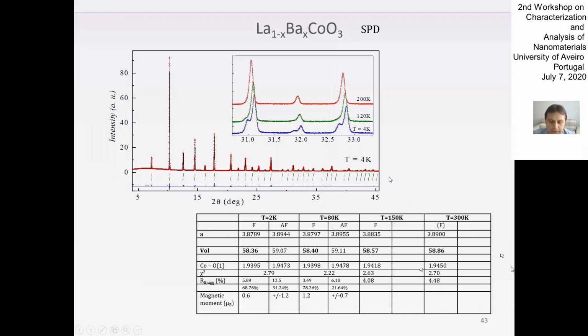So about this phase separation, we discovered it using synchrotron radiation. Then we refined two structural phases. It's not because of the drawbacks of the synthesis method. It's just an intrinsic state of the compound, because when we heat it up, we found that it becomes single phase at elevated temperature, and at low temperature it's separated into two different crystal phases with some parameters for these phases.